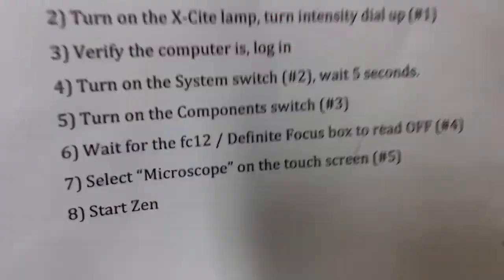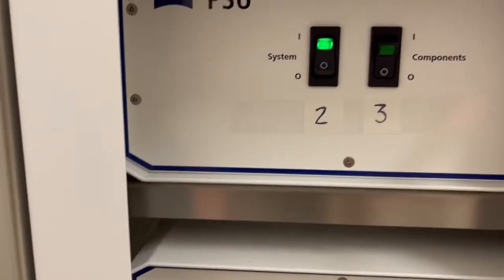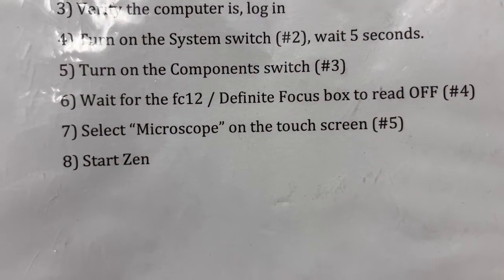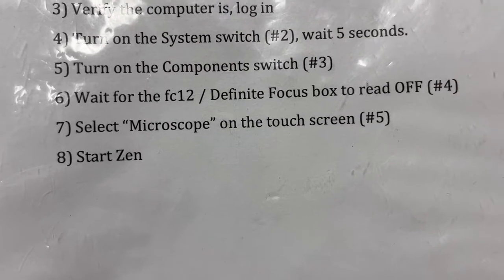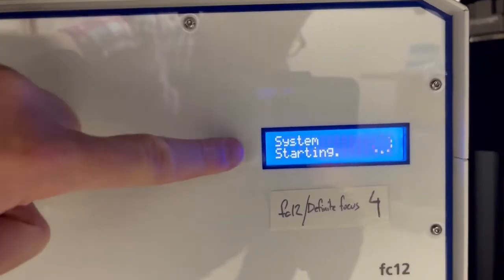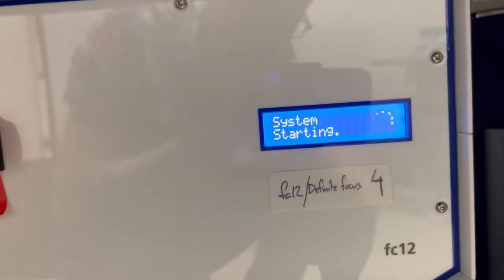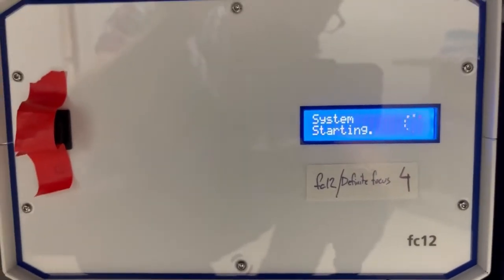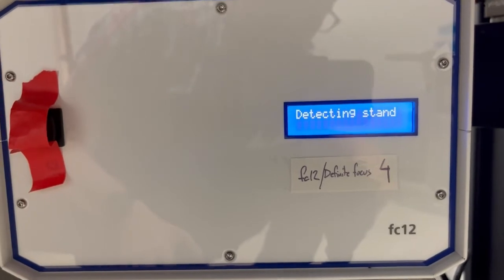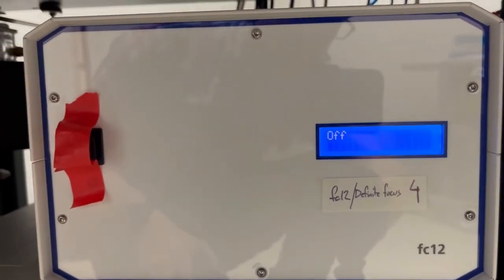We're going to turn on the component switch, which is number three. So we're going to go back here and turn on components. Step number six is to wait for the FC-12 definite focus box to read off — that's number four. You can look down here under the table. This is the FC-12 or definite focus box, and we want this to eventually say off. That's a little confusing, but the system turns a bunch of things on, and this box controls a component that's optional, and it ends up in the off state after successful startup.